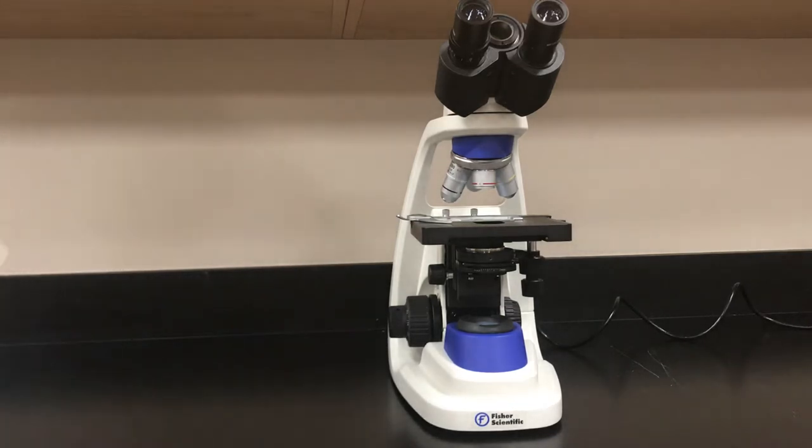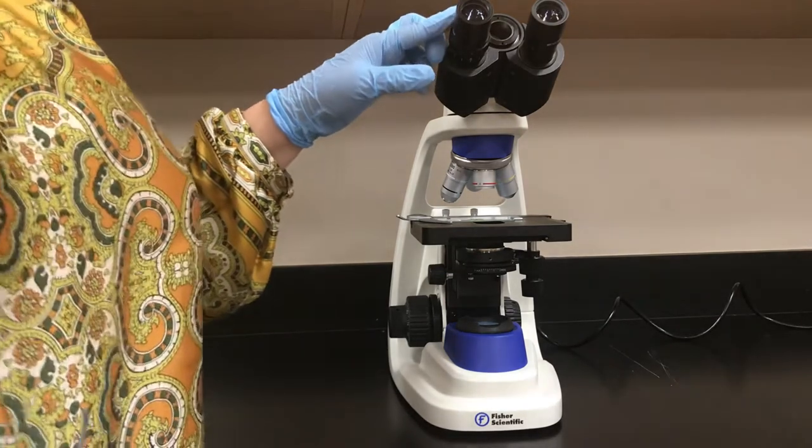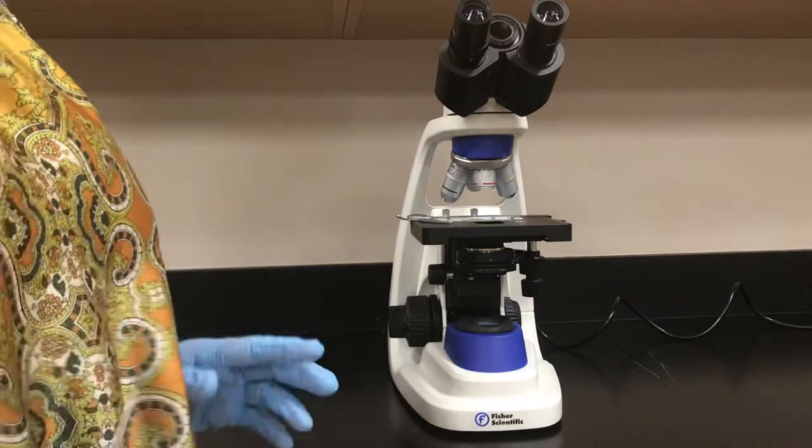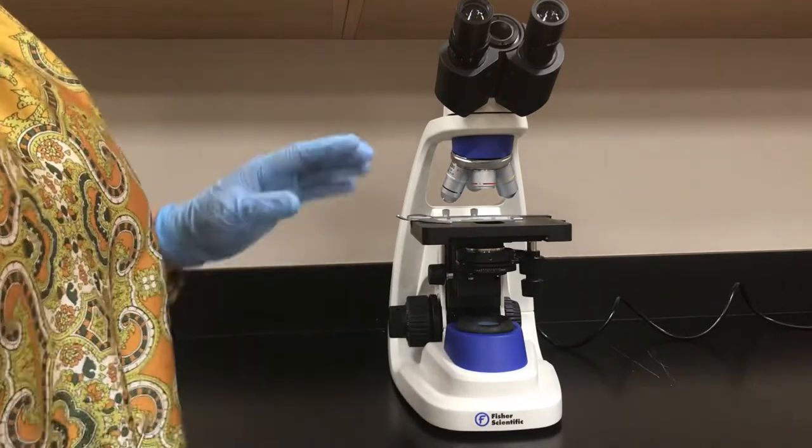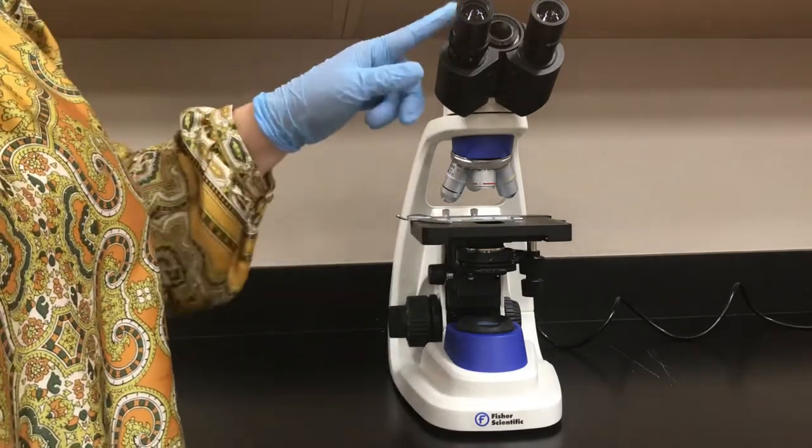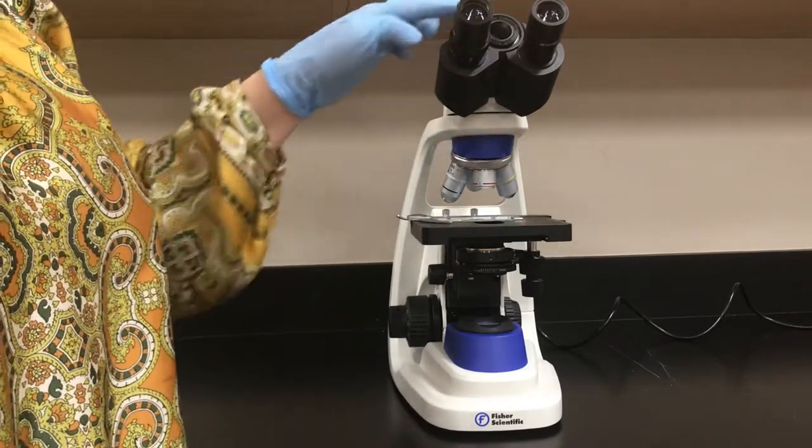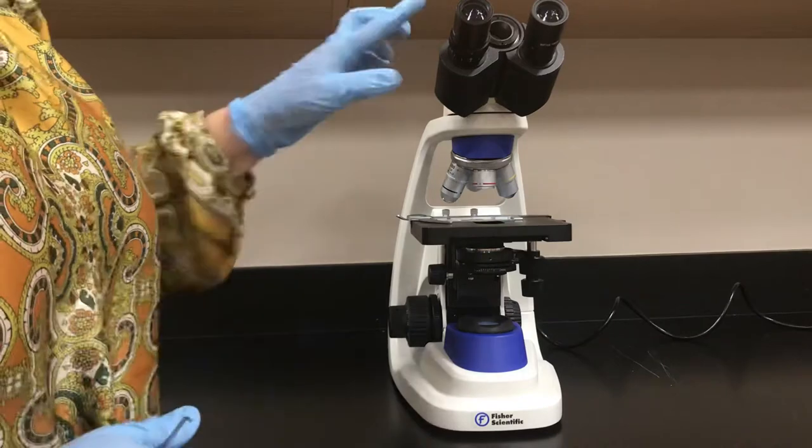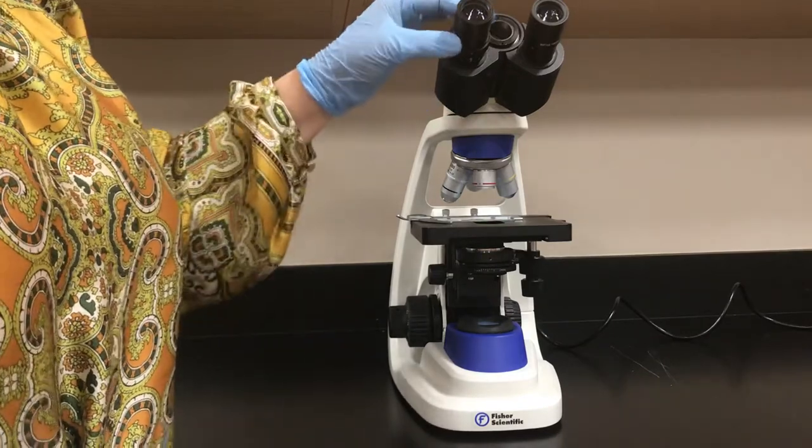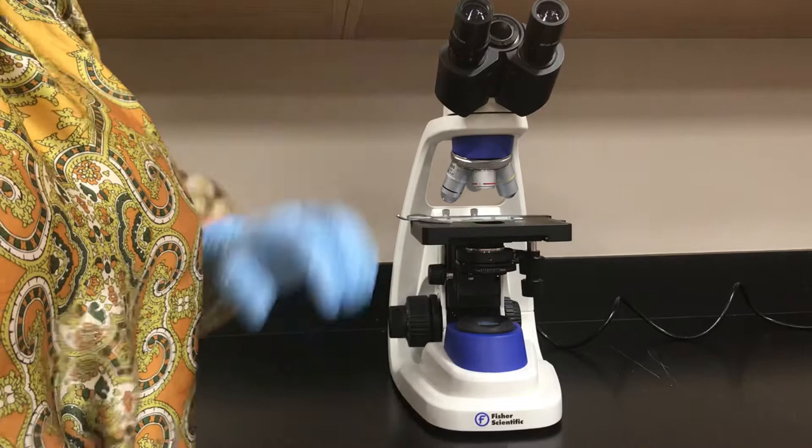Hi, this is Dr. Martin. In this video I'll talk about the compound light microscope. We have three different groups of lenses. The first group of lenses we call ocular. This is binocular, there's two of them, and we use two eyes to focus, so we call them ocular or eyepieces. Oculars have 10 times magnification power. That's a standard value.